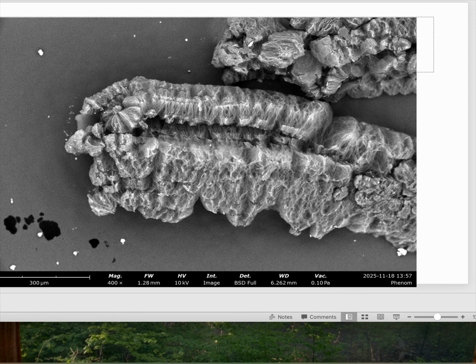The next image, 400 times. And you start to get a feel for the basal planes and walls. It's a fascinating material. It's one of a number of components that we formulate. I have YouTube videos where I'm showing the formation of composites and deposition by brush on glass fiber mat or oxidized graphite felt.